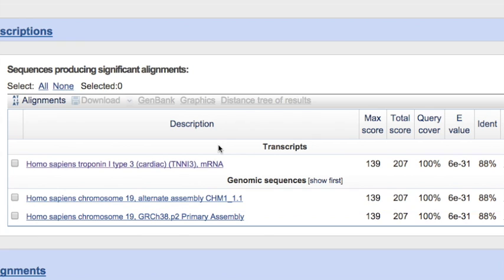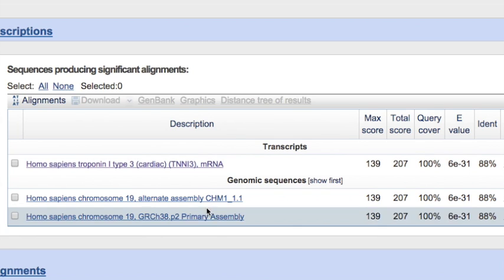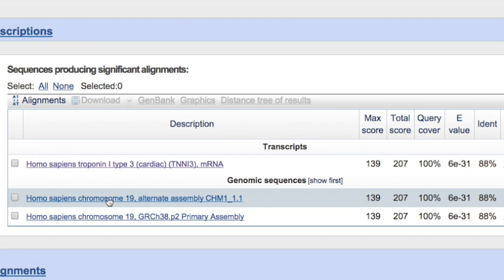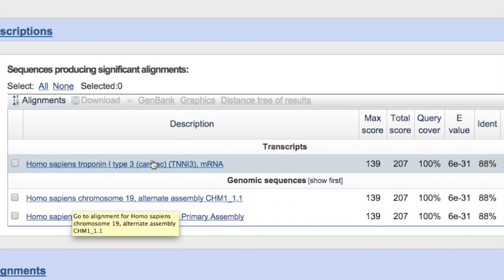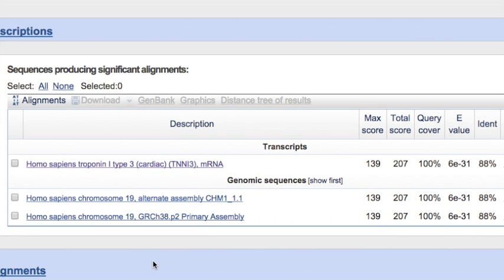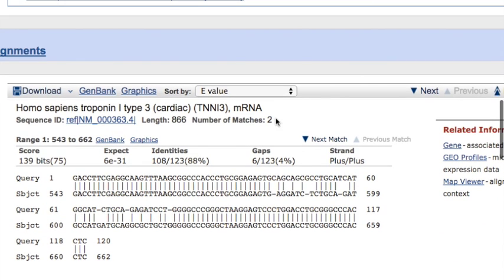The E value indicates the statistical likelihood of these matches being done sort of out of random chance and that indicates incredibly unlikely matching by random chance. So we have both a cDNA sequence, listed as mRNA, and then we have genomic sequences which are from complete genome sequences. Literally this is the entire sequence for chromosome 19, all hundreds of millions of base pairs.